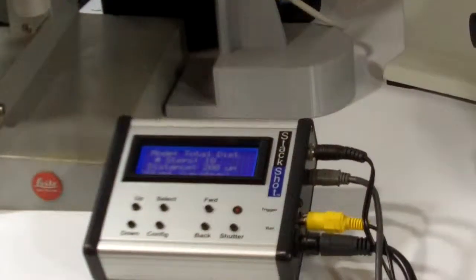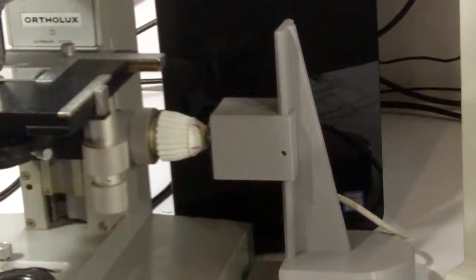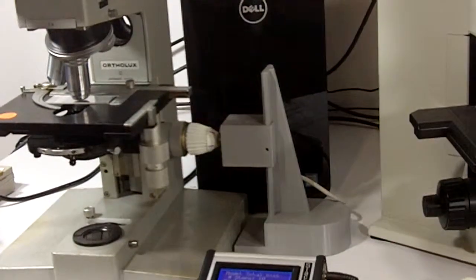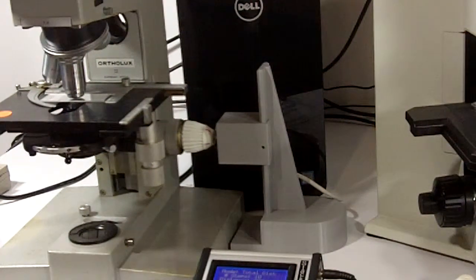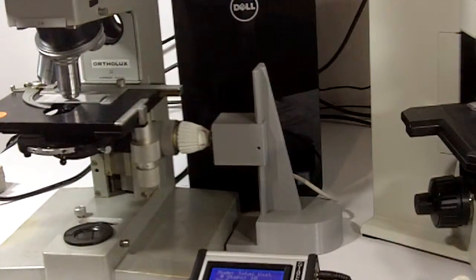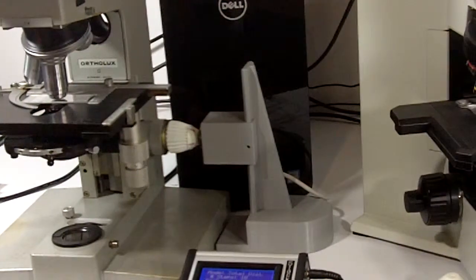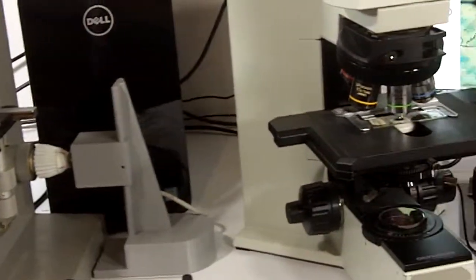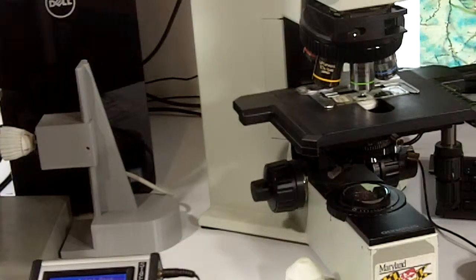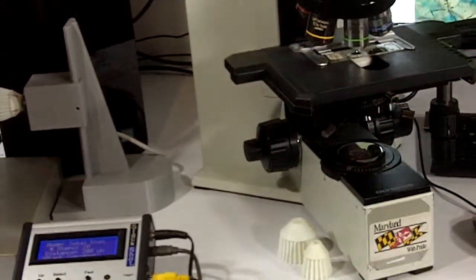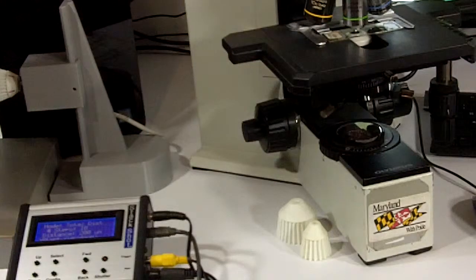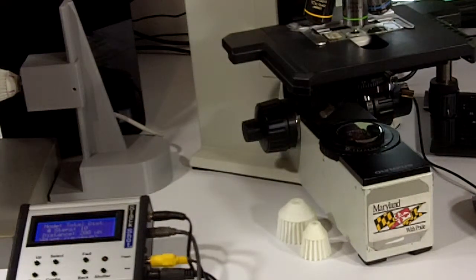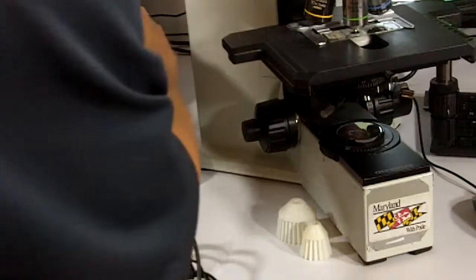What I want to show you now is a quick switchover to another microscope next door. This is a later Olympus BX microscope, and we're going to attach the system to that. So bear with me and we'll make a little switch here.